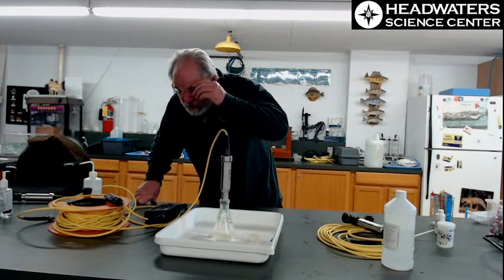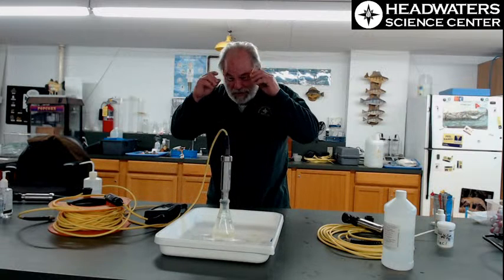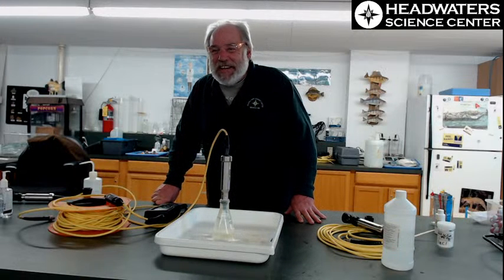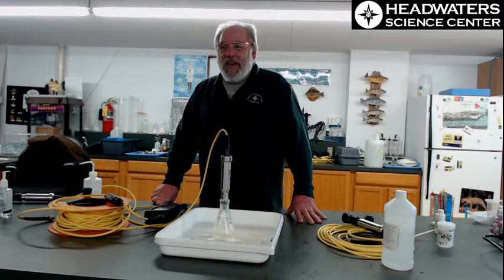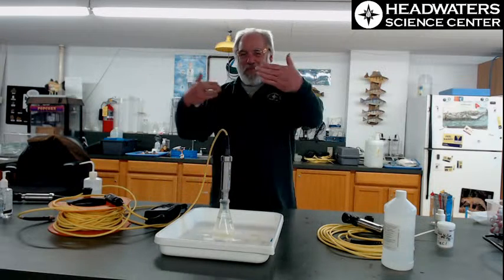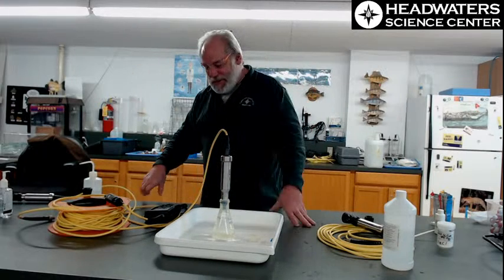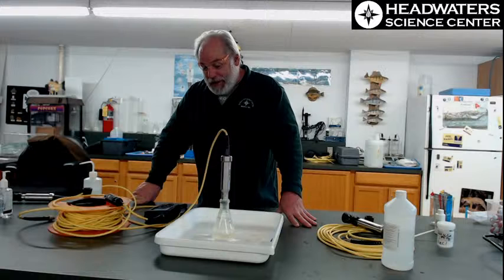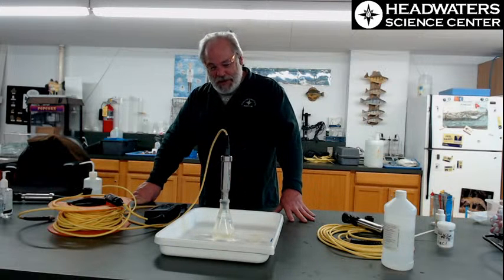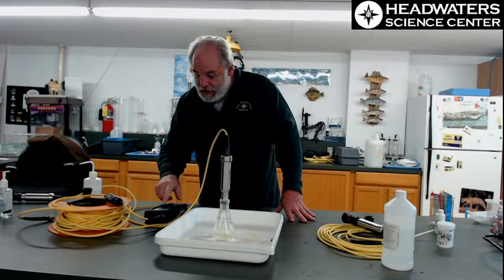I'm moving in on my calibration here. Oh, I think we're gonna get the pretty colors. Here they come. That's when you know your calibration's occurred. Pretty colors happen, a little red, a little blue, and the meter said yes.